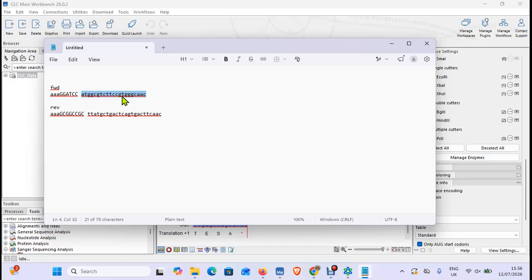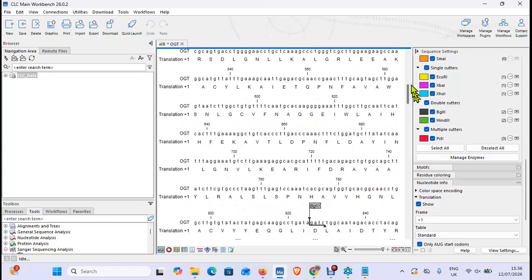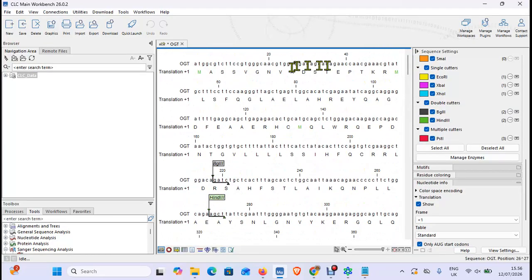Let's imagine instead we don't have plasmids. We have at best a stash of cDNA from someone, or a supply of RNA which we can do an RT on. So now let's see where we left off and instead make the primers slightly more substantial. Panning over to our forward primer, all the way back to the start of the template.